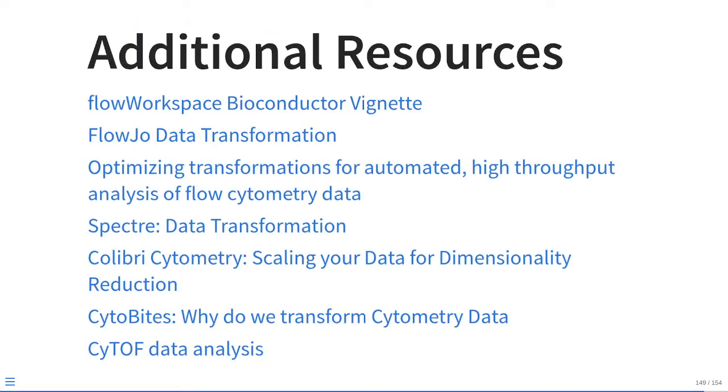Additional resources for today. Today I was focused mainly on the mechanics of how to implement a transformation in R. I didn't have the time to explain what you actually want to have in properly looking transformed data. Fortunately, this is an area the community has provided a lot of good resources for already, so I don't feel as bad just pointing you to the additional resources.